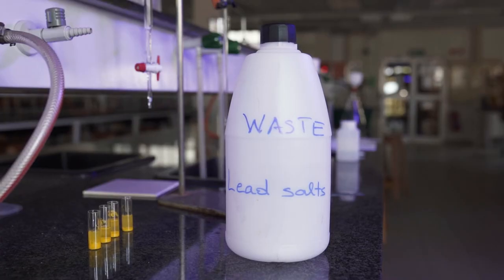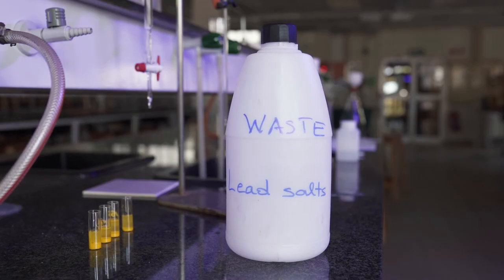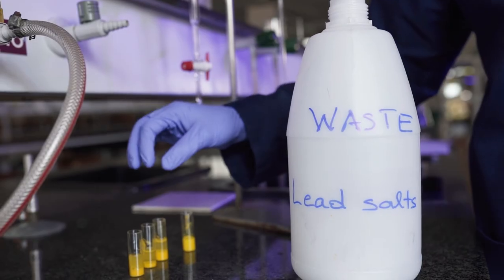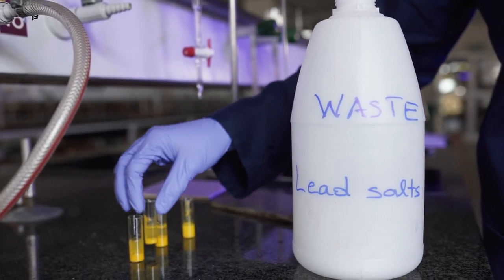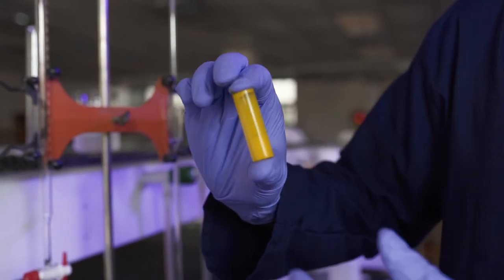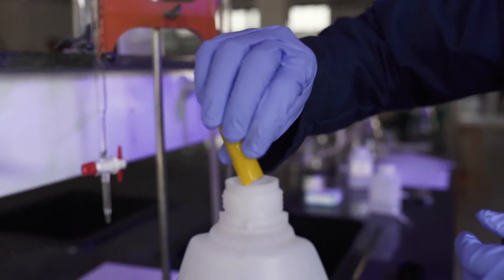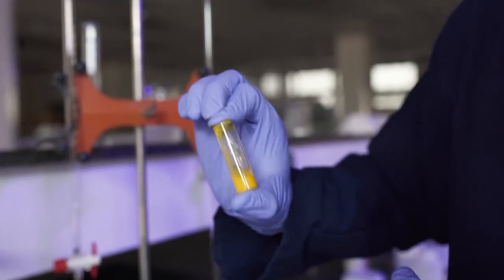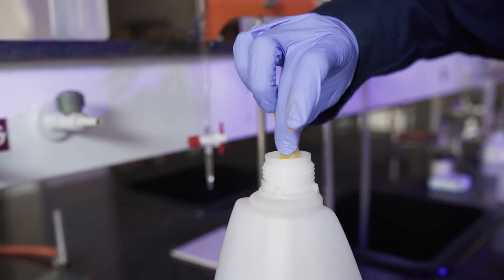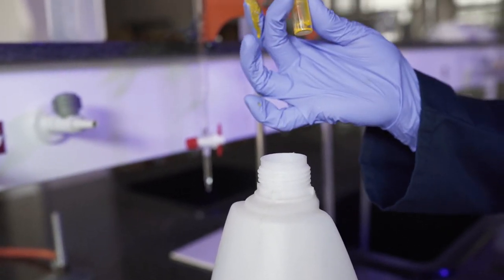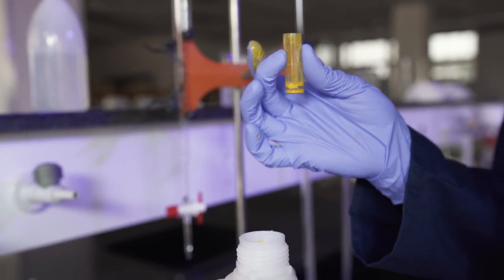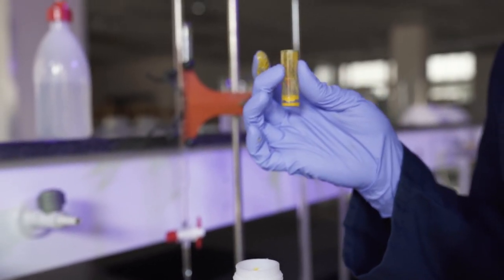Remember that the insoluble lead iodide precipitate that formed is toxic and needs to be disposed of in lead waste. To get the precipitate into solution so that it can be decanted into the waste disposal, we simply shake it so that the precipitate is suspended in solution, after which we decant it into the container. The lead iodide that is left in the vial must be wiped out with tissue paper which should be disposed of in solid waste containers.